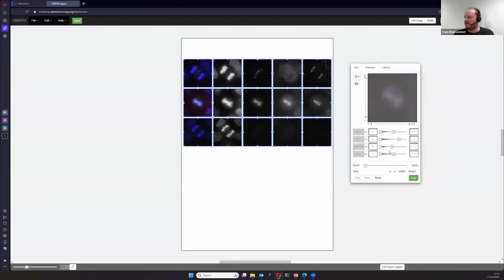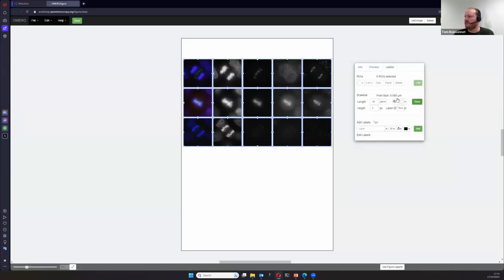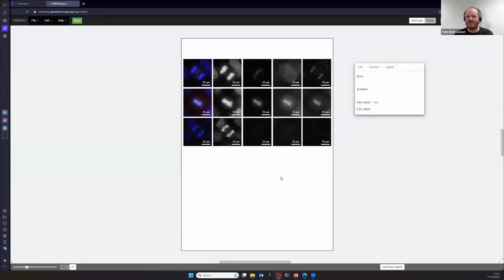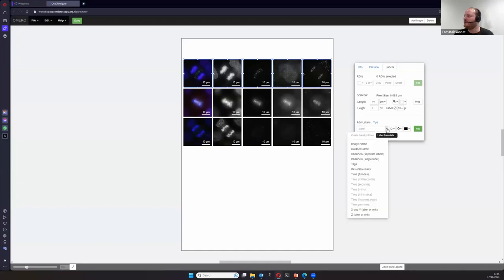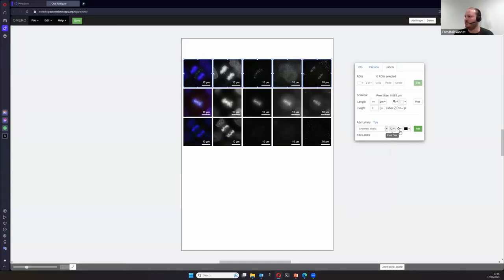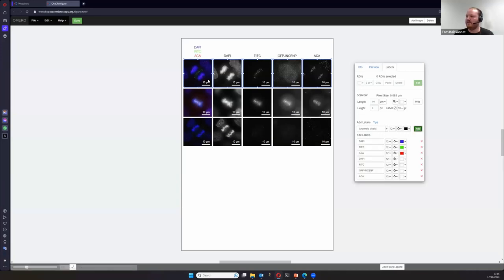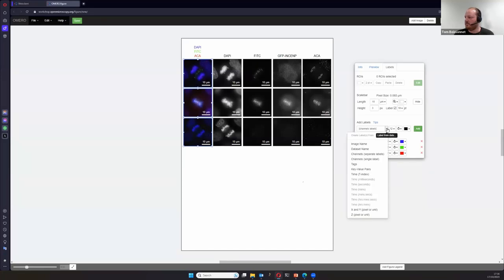In this panel I can choose the preview — adjust contrast as I just did. You could also adjust the zoom, Z slice, or time point to go through your image. Going to Labels, you can add things to your images. I'm going to show the scale bar: reading the pixel size value, it automatically puts the scale bar to the right size. Since we're working with images linked to their metadata, we can also add labels originating from this metadata.